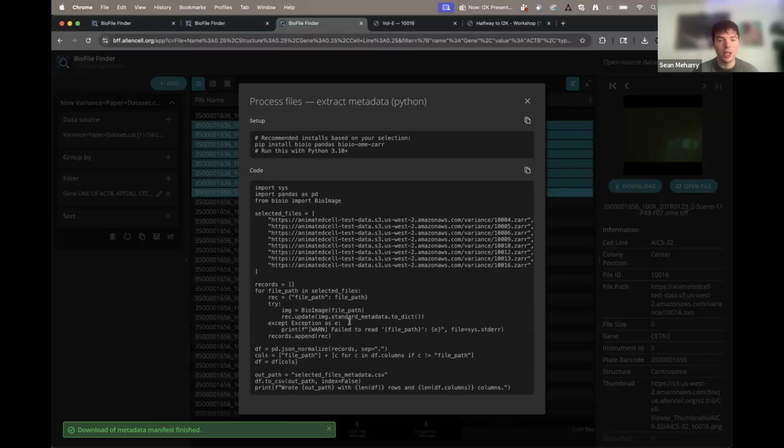all of the standard metadata that we could pull out using BioIO. And what standard metadata means is specific to BioIO. The tool will explain to you what exactly that means. But for the purpose of this, it really just means there are about 8 columns that we think are generally high value to most people, and we pull those out of the files automatically.